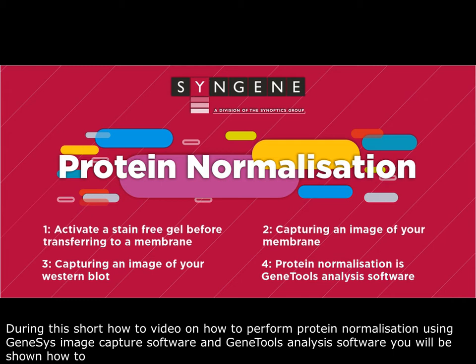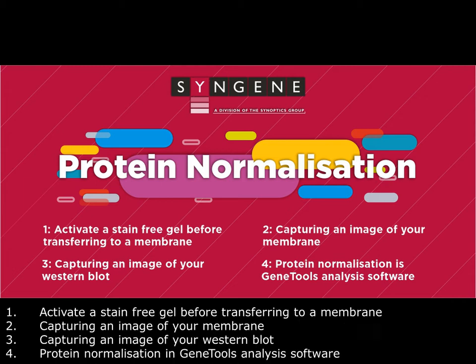During this short how-to video on how to perform protein normalisation using Genesys image capture software and Gene Tools analysis software, you'll be shown how to: 1. Activate a stain-free gel before transferring to a membrane, 2. Capture an image of your membrane, 3. Capture an image of your Western blot, 4. Perform protein normalisation in Gene Tools analysis software.